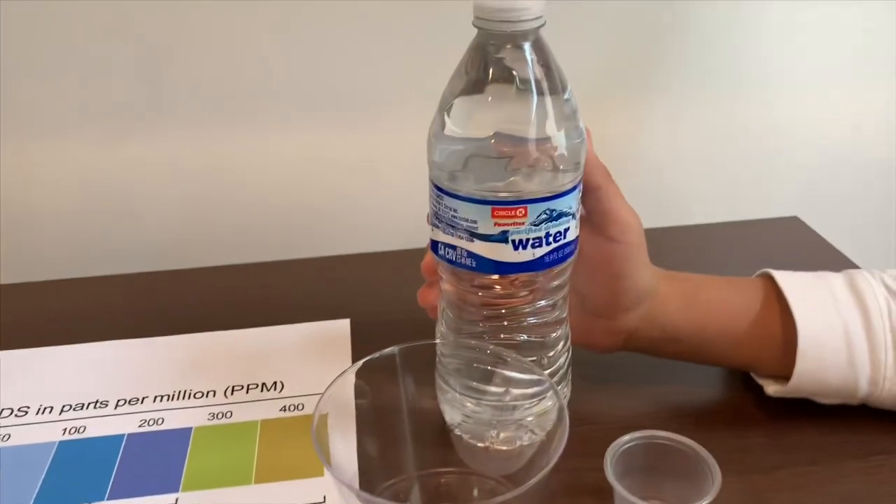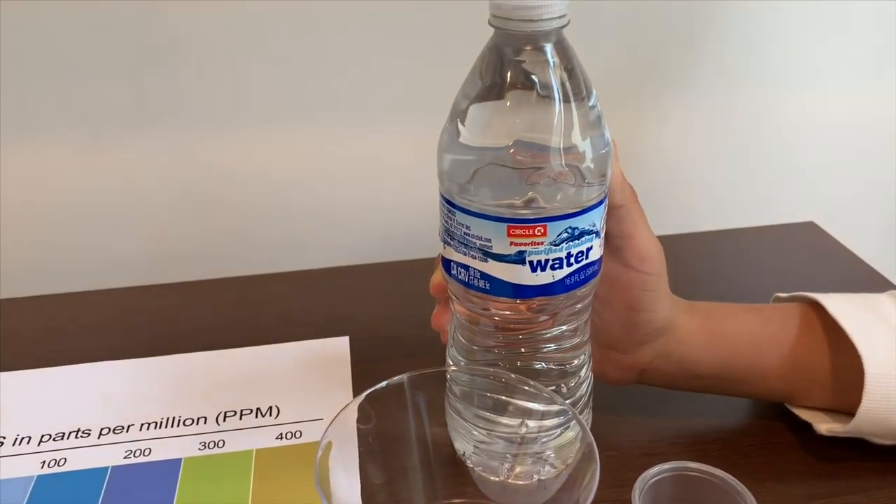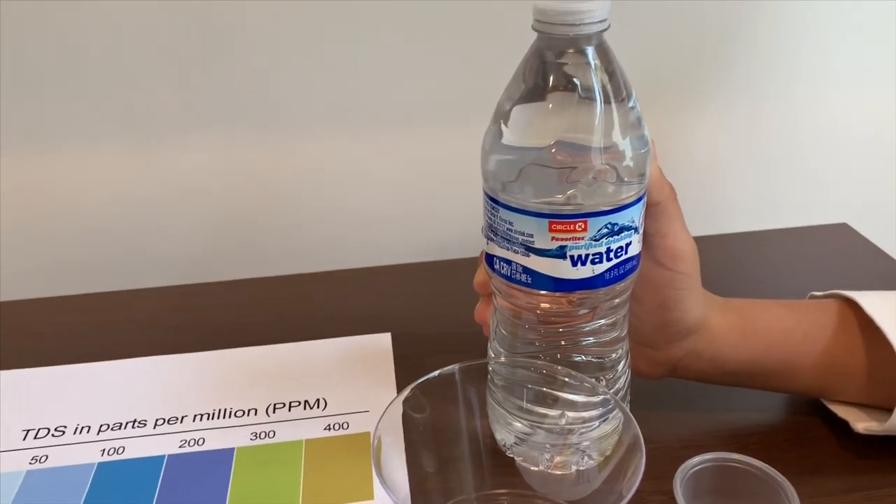Now we're going to test Circle K purified drinking water. This is also bottled by Niagara.